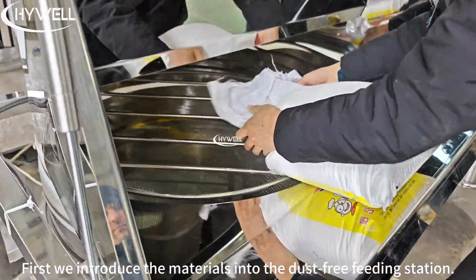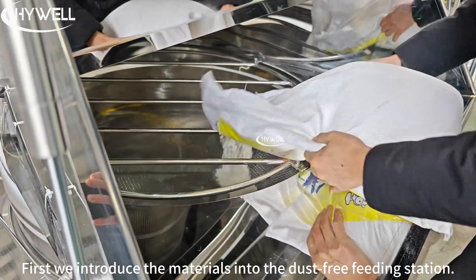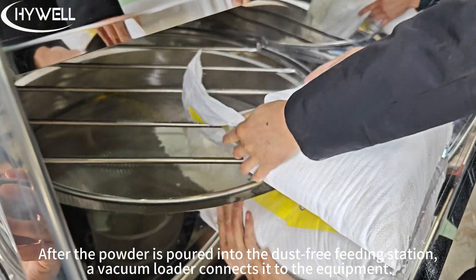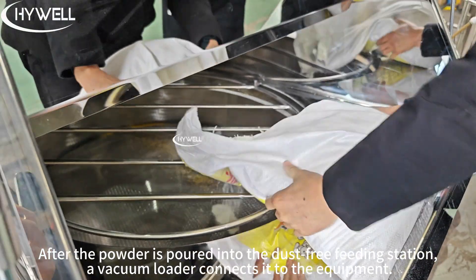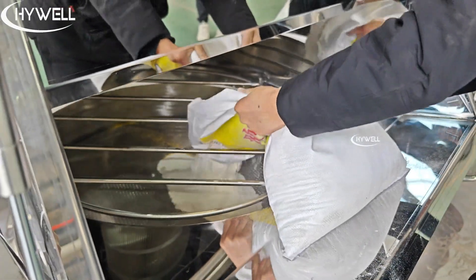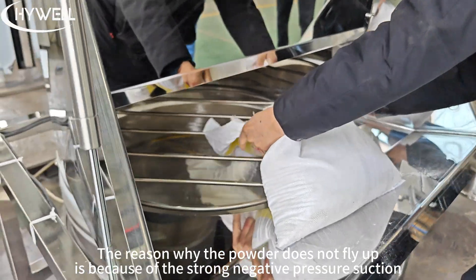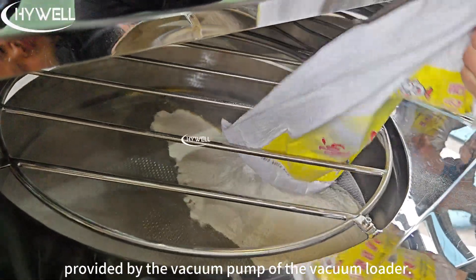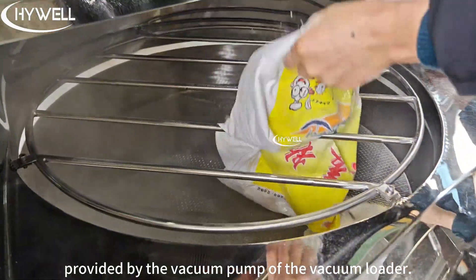First, we introduce the materials into the dust-free feeding station. After the powder is poured into the dust-free feeding station, a vacuum loader connects it to the equipment. The reason why the powder does not fly up is because of the strong negative pressure suction provided by the vacuum pump of the vacuum loader.